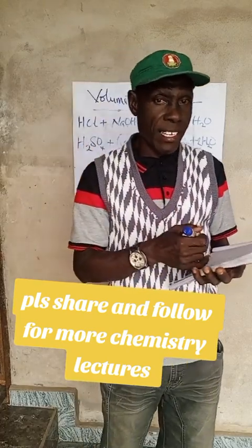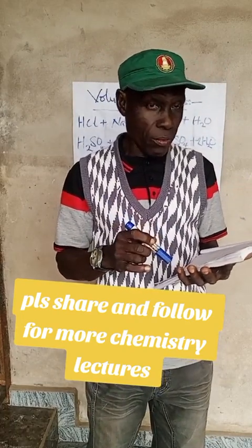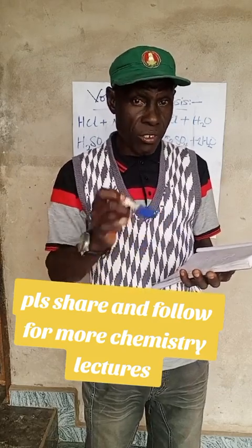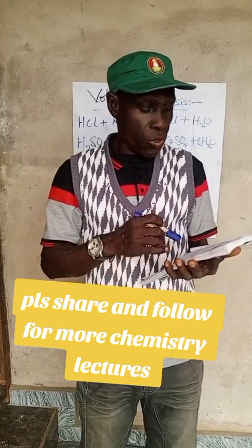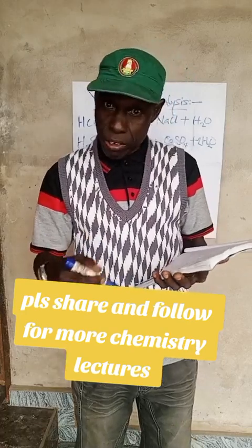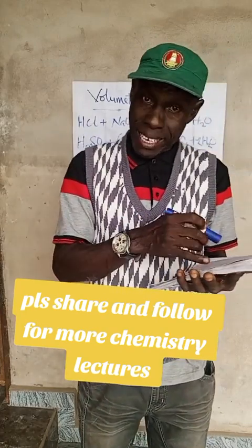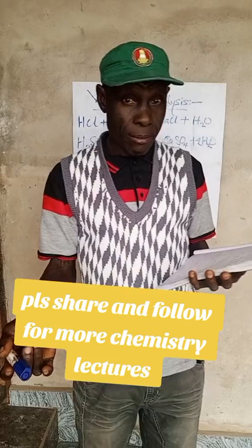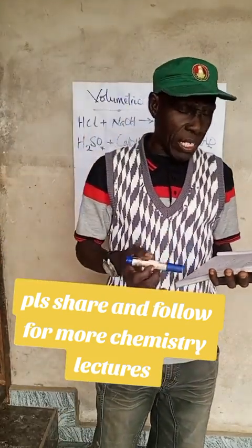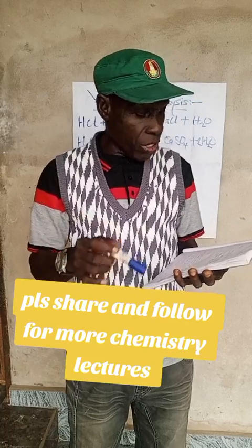On the reagent side, one, you need dilute acid to be used, for example H2SO4, which is tetraoxosulfuric acid. Two, some volume of the base to be used, for example sodium hydroxide solution. Then you have an indicator, either methyl orange or phenolphthalein. Before you run the dilute acid against the base, you must carry out the following activities.